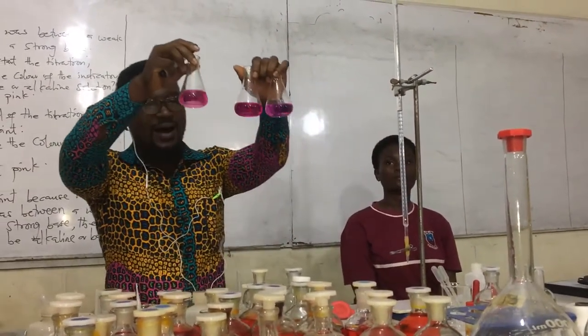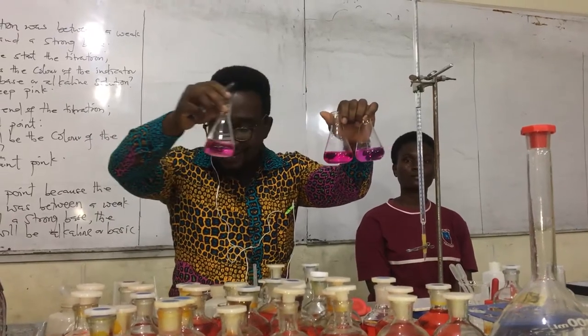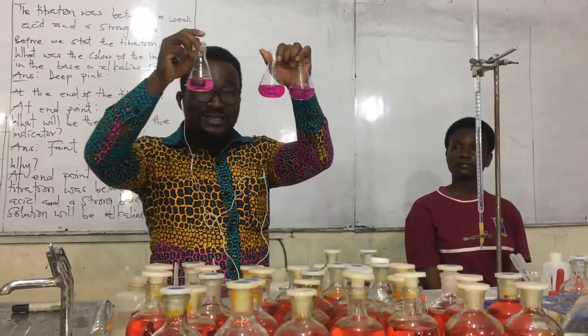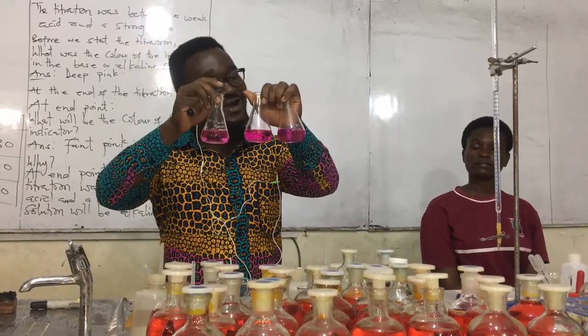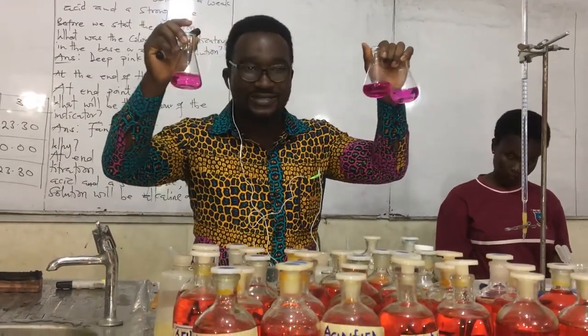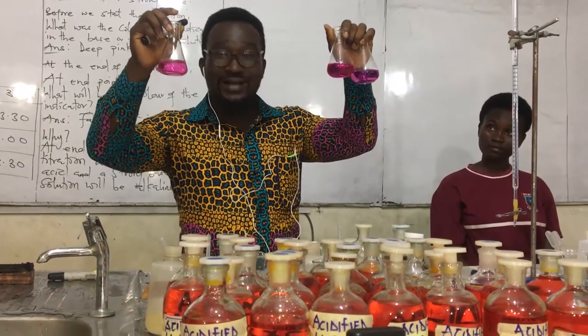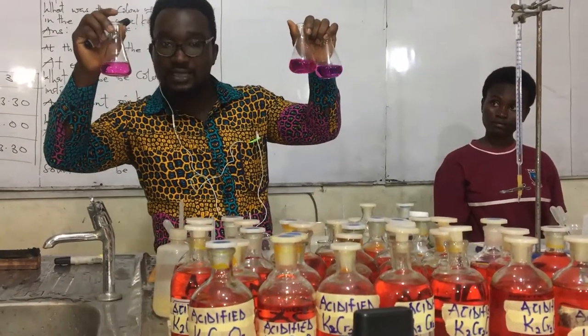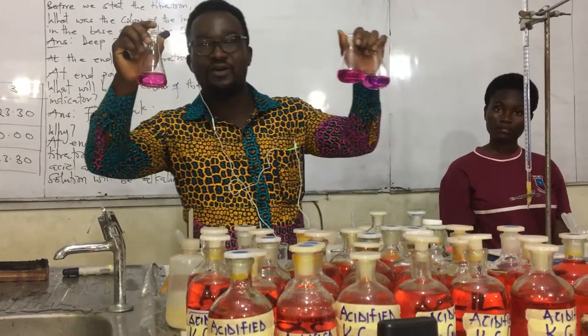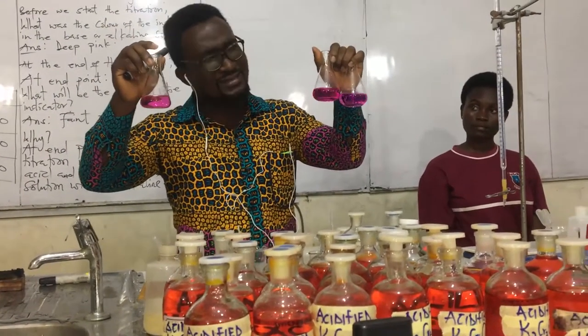So we have our system over here nicely. In fact, my WASSCE candidates, if you are watching this, whenever you go to the room and approach anything of the sort, that is what is expected of you. You can see that it is almost colorless, but it is not. When you approach colorless, you have also ended up in a very different thing.